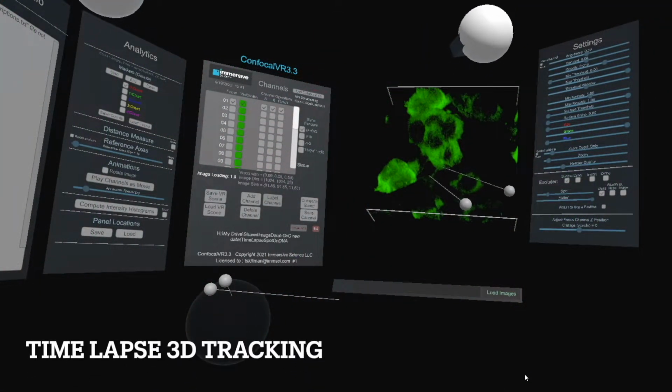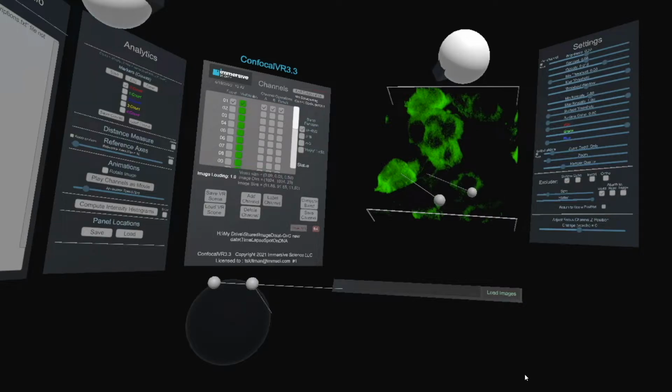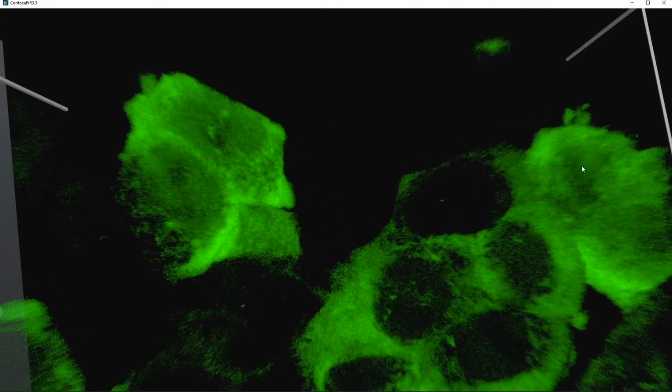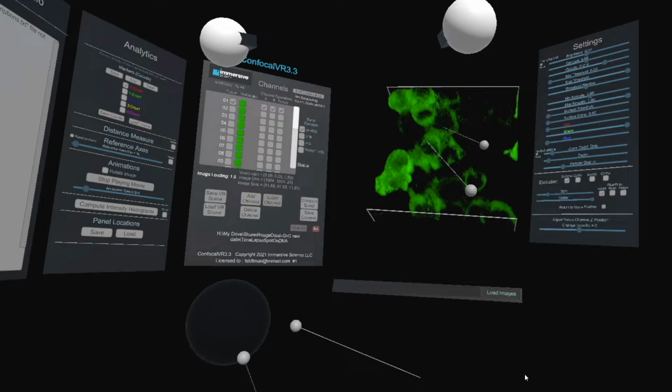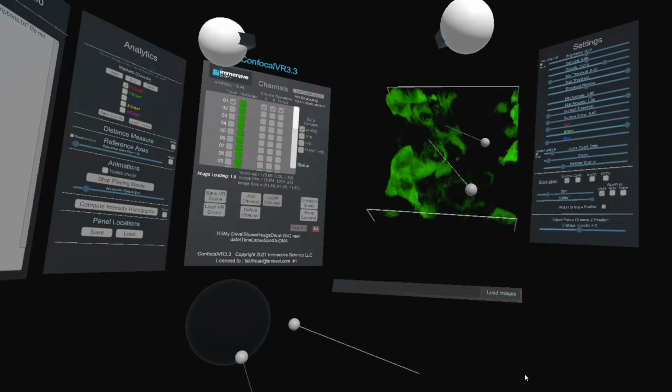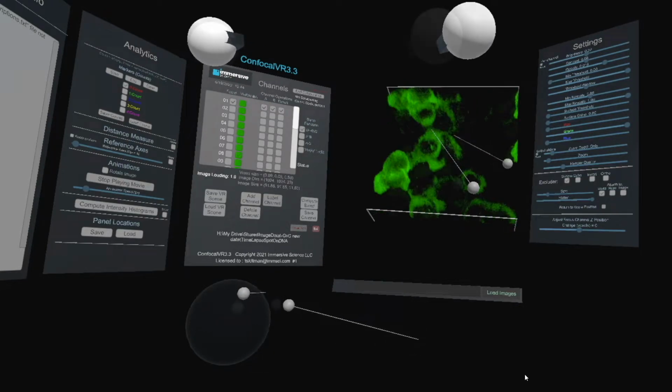So what we did here is we put a label in the DNA, and on that label we bind a fluorescent tag. In this way, we can really follow the spot of the DNA in time. However, what we found out is that if you do this, there is much more movement in the DNA than we expected. And here in 3D, you can nicely follow the spot all the time because you see all dimensions. You see X, Y, and Z.